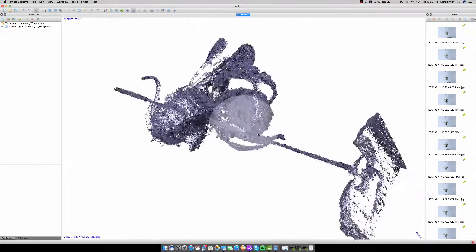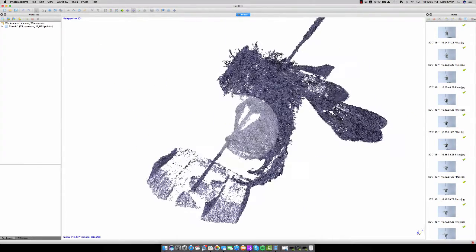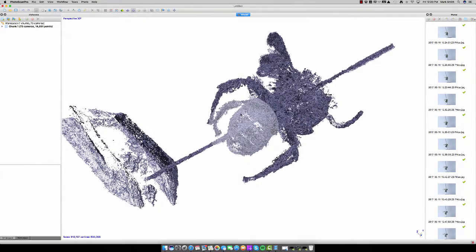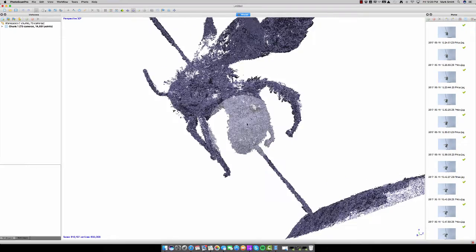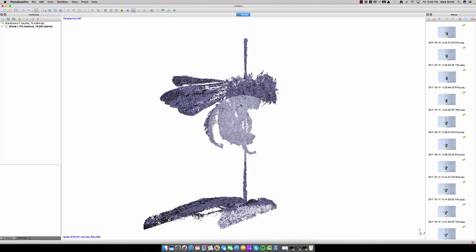And it's also important to bear in mind that we modeled this using 1x magnification just for the sake of time and ease of use and instruction. But again, if you were to do this same sample at 2x or even 3x magnification where everything's shown in context, it really is amazing how accurate this software is and has proven to be. It's been shown time and time again in scientific publications that this method of reconstruction is incredibly accurate, almost if not 100%.